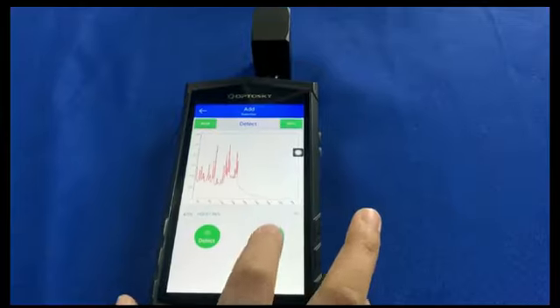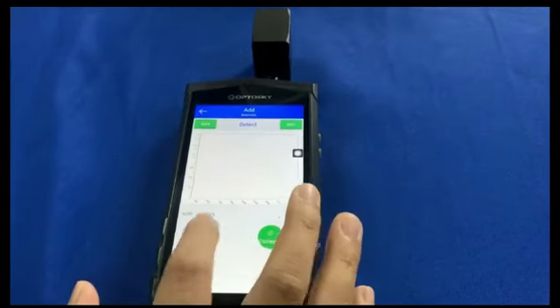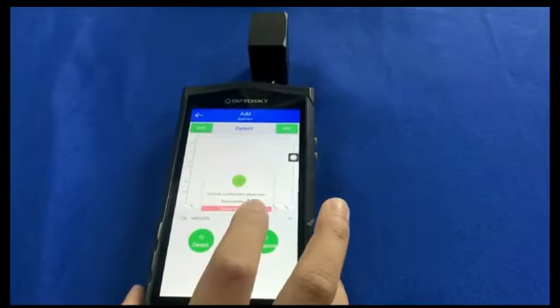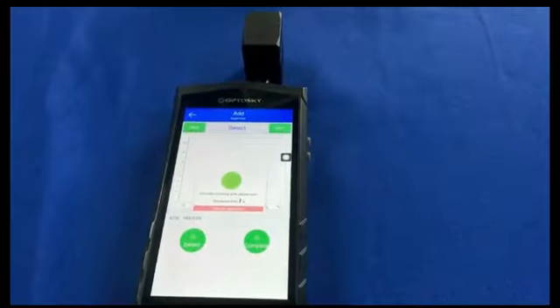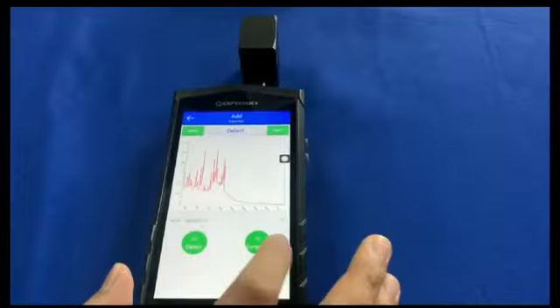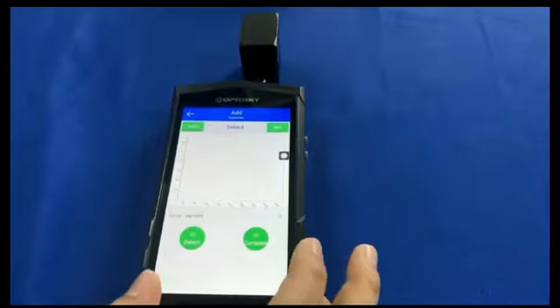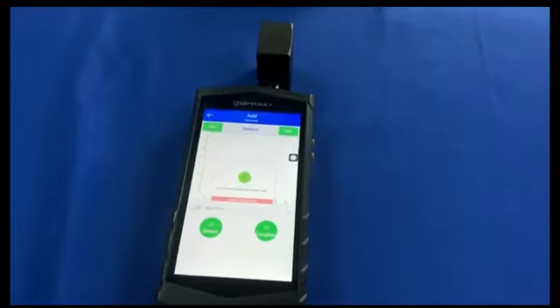Such as if you have purchased many batches of paracetamol, you need to scan all these batches to save a method. So that it can improve the similarity of the raw material to be compared and matched.